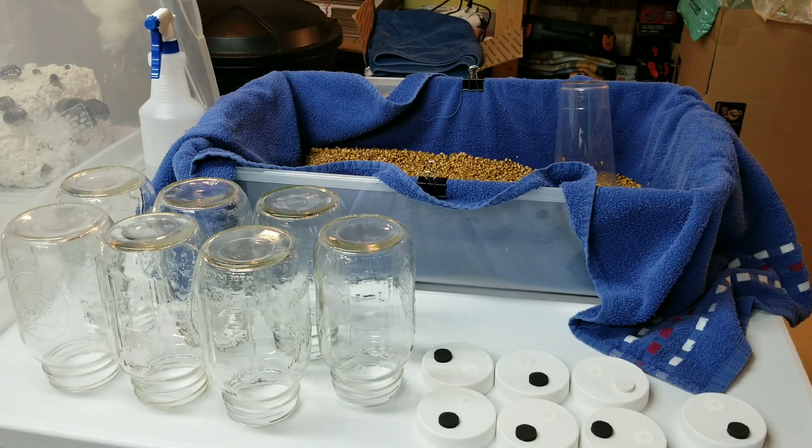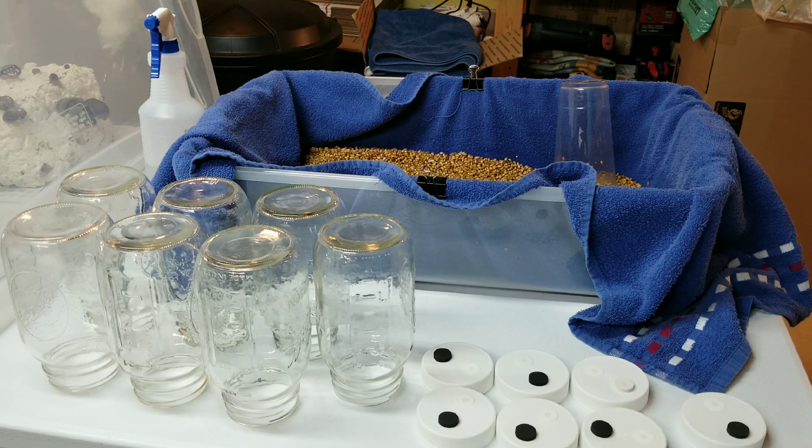Hey, what's up guys, welcome back to the Mushroom Dungeon. I've been getting a lot of questions lately about grain spawn - specifically what grain spawn is supposed to look like before it goes in the pressure cooker and after it comes out of the pressure cooker. We're gonna go ahead and do that in this video.